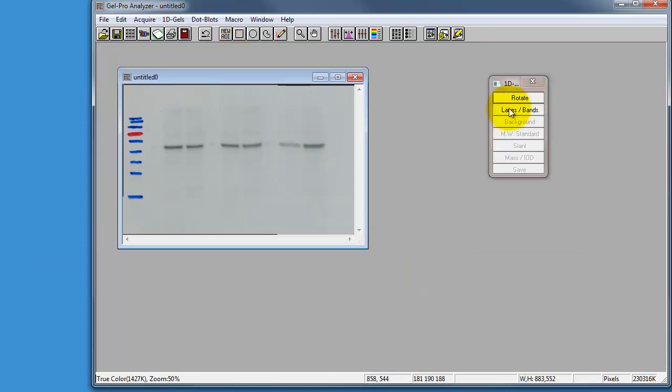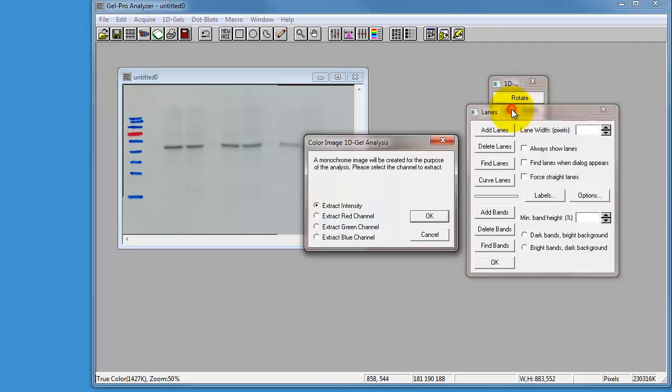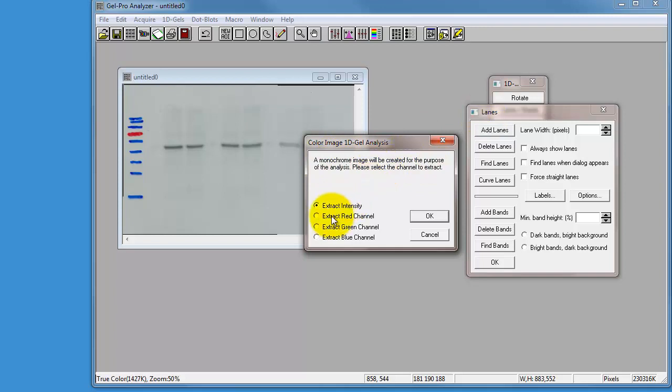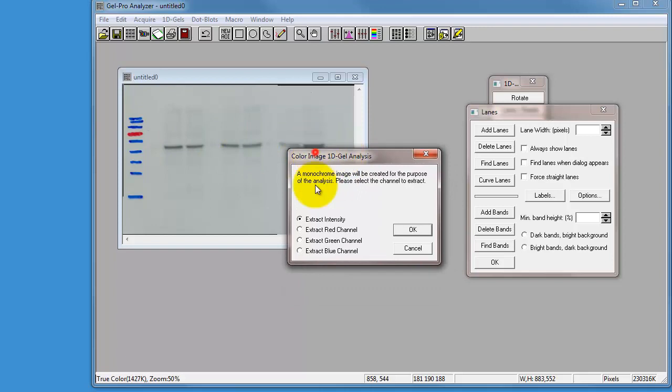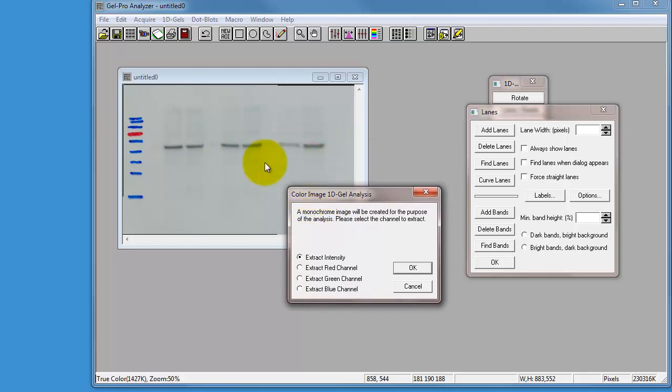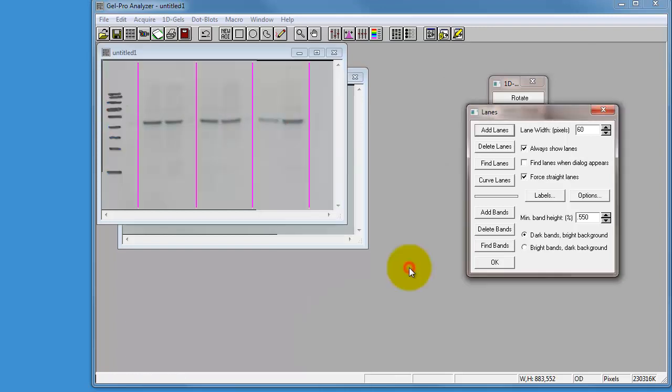The next thing to do is add lanes and bands. When I click on this button, it'll tell me that my image is in color, and I need to make it into a monochrome image to analyze it correctly. So it says here, a monochrome image needs to be created. You can choose whether you extract the red, green, or blue channel, or just intensity. But since this is a grayscale development on photographic film, we're just going to go extract intensity and click on there.